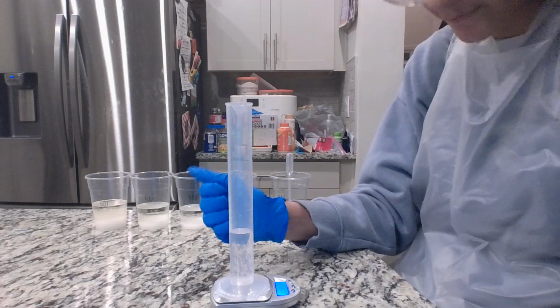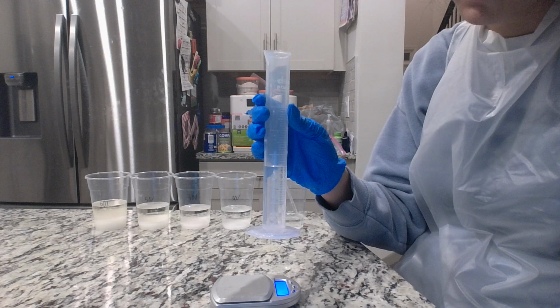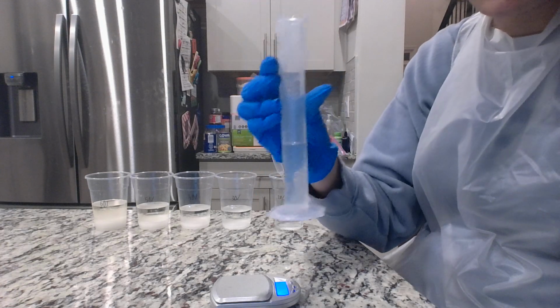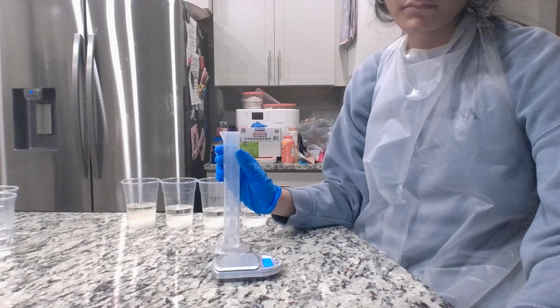And it weighs about 52.8 grams. This is 25 milliliters, which weighs about 57.10 grams.